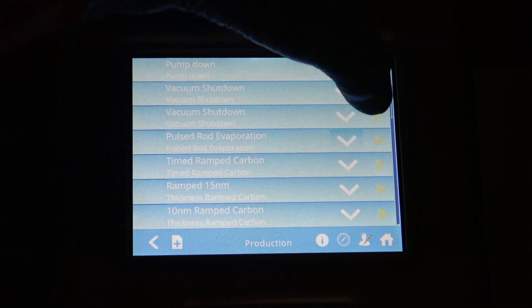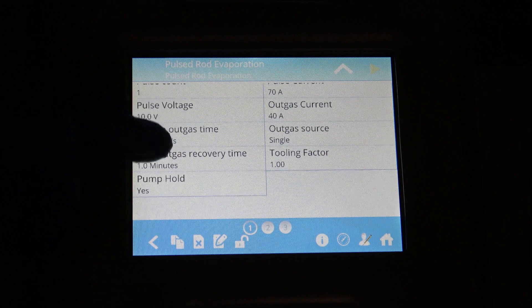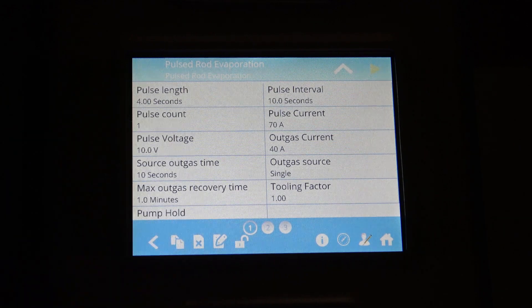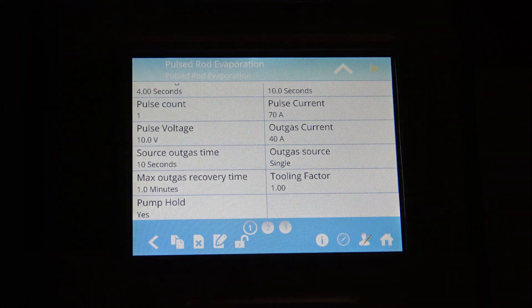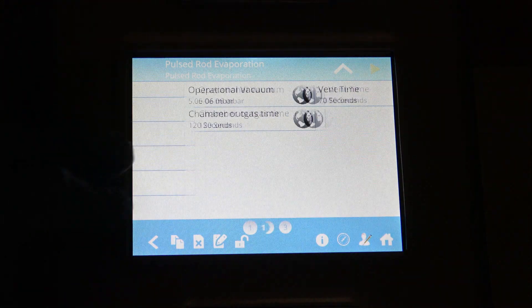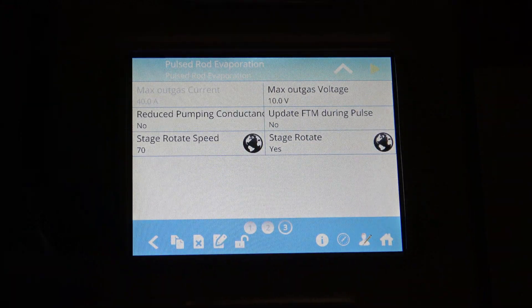Pulsed rod evaporation is not a high-degree-accuracy coating. Depending on your pulse length, number of pulses, and pulse current, these factors will determine how the different thicknesses are applied to your substrate. You can get very thin or very thick coatings for those who need it, and it has three screens which you can get to by moving side to side or pressing the buttons below.